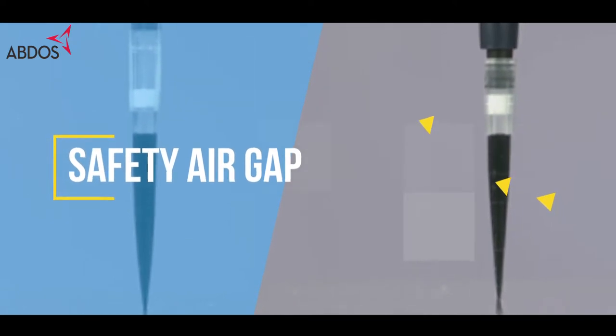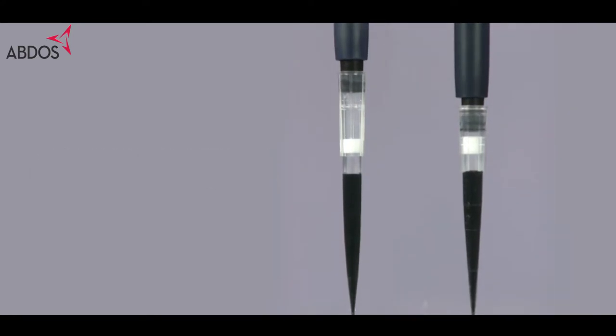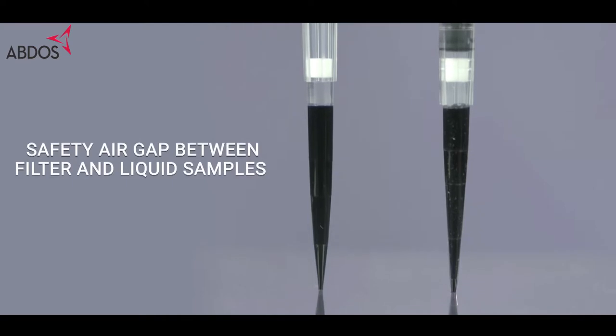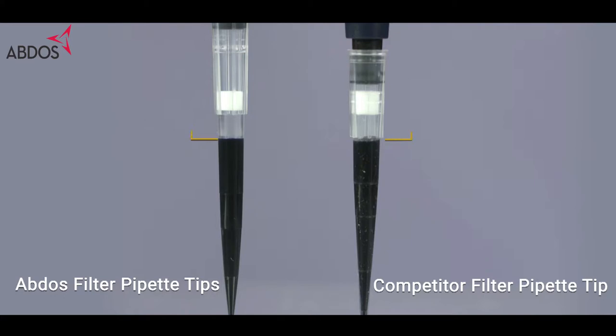In comparison to our competitors, ABDOS super filter pipette tips have more air gap between the filter and the pivot shaft, and between the filter and liquid. This ensures smooth and hassle-free pipetting with a safety air gap to prevent cross-contamination.